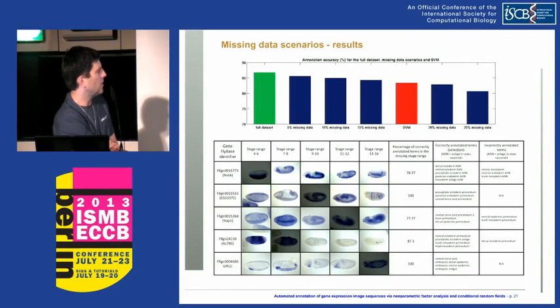And I'm also showing here some examples in which, for this very gene, I removed this image from stage range 4-6, and we're able to annotate accurately the next 4 stages with an accuracy of 78%, or even lower. If we remove the stage range 13-16, we're still able to reconstitute the entire set of four labels for the previous stages.